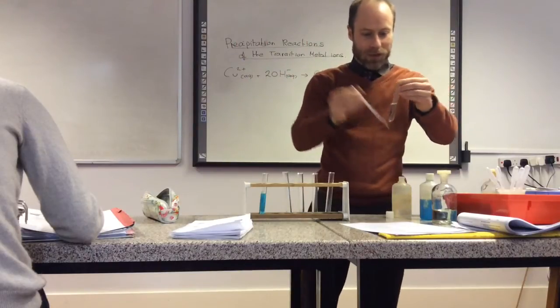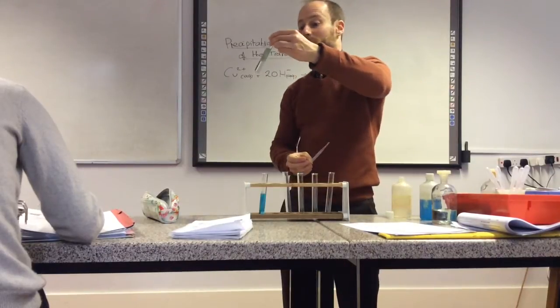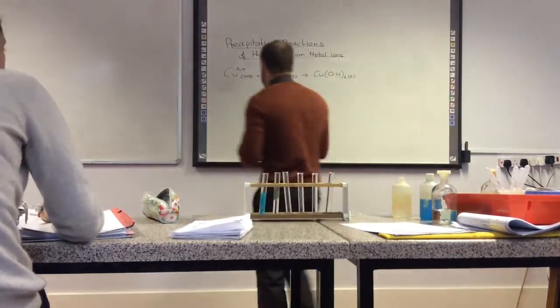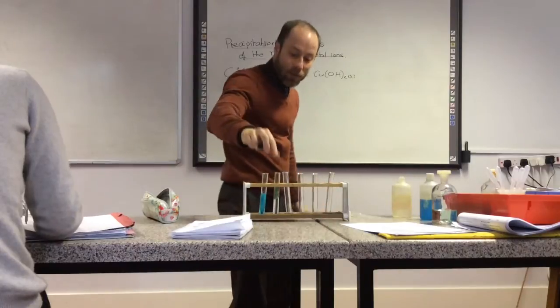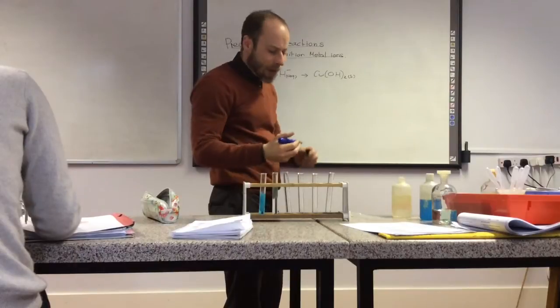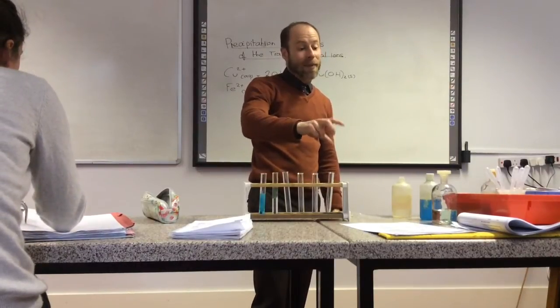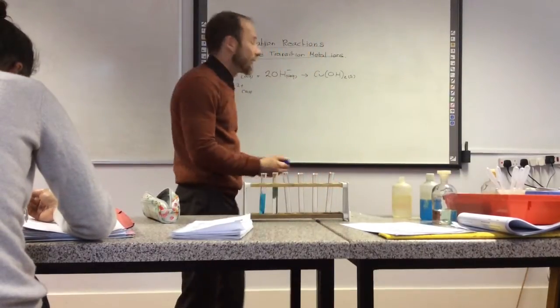That's not quite working — let's try again. Yay! So that is definitely green. It's only green at the top because the sodium hydroxide hasn't got all the way down to the bottom yet. I think it's probably got some acid in it to stabilise it, because otherwise iron 2+ becomes iron 3+ as it gets oxidised. So we stabilise it by putting some acid in — the sodium hydroxide first has to neutralise the acid before it can work.